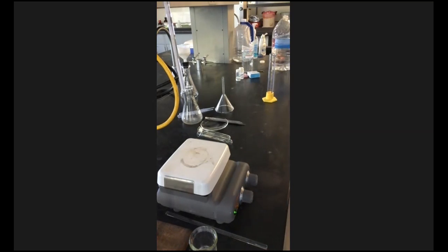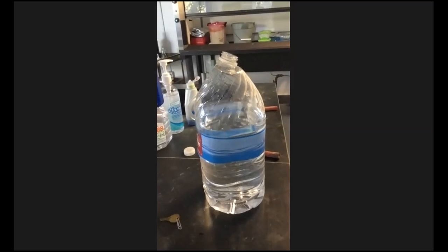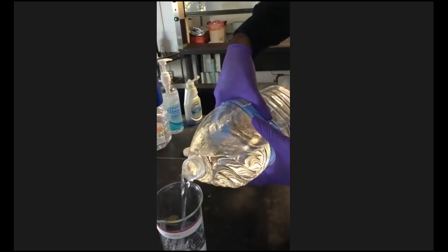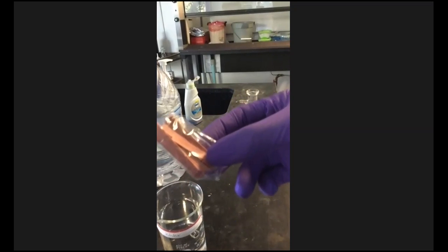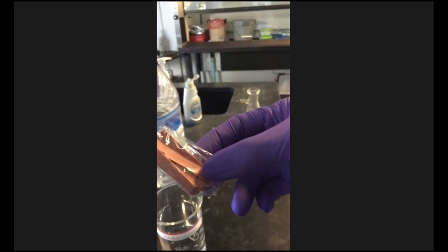So we go over here. We're just going to use the regular purified water, and I'm going to pour that here. Fill it up. And then, so here's my pH paper. If it stays red, it's acidic. All right. If it turns blue, then it's basic. Let me take that back. Stays red is neutral. If it turns blue, it's basic.